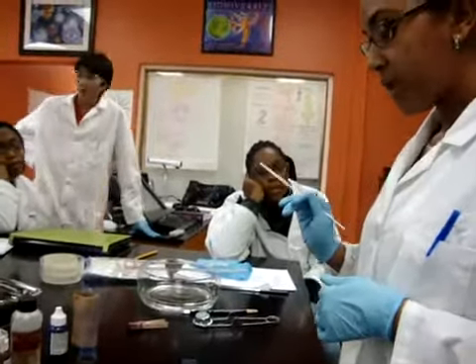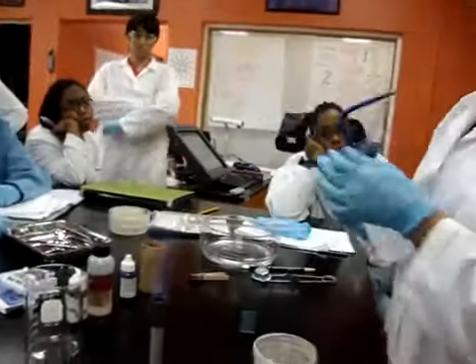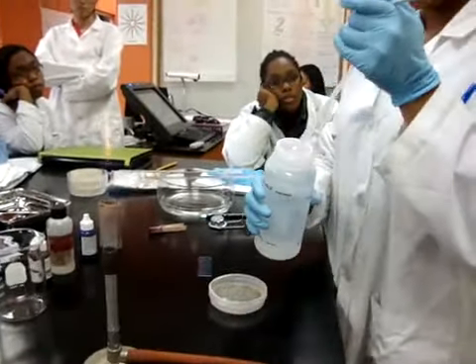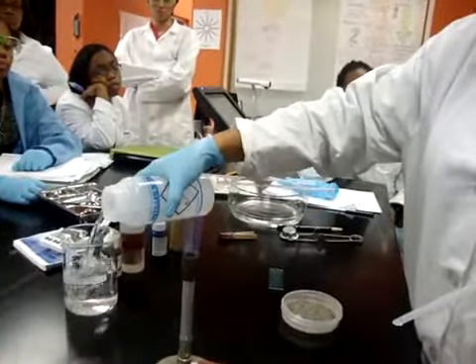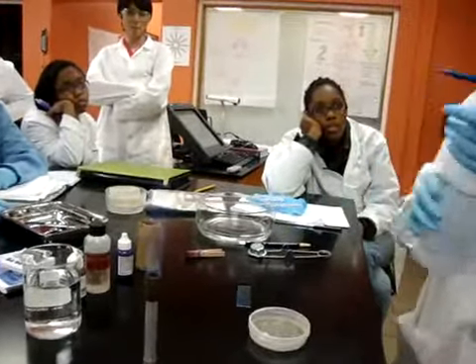Okay, so to prepare your smear, you're going to have your beaker of distilled water. And we are doing a smear from solid media. I think your lab procedure gives you instructions on how to do a smear from liquid media. But we're just going to do solid media.